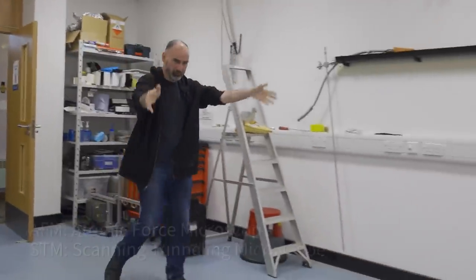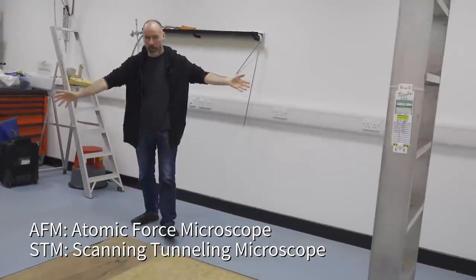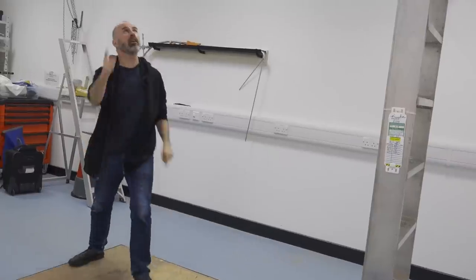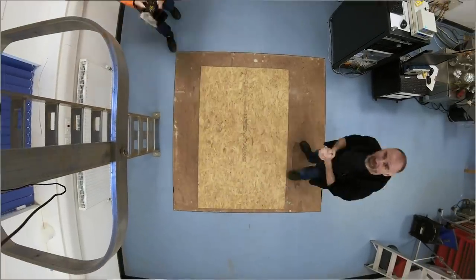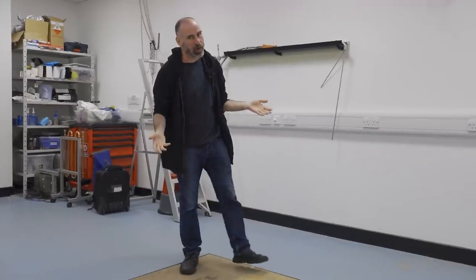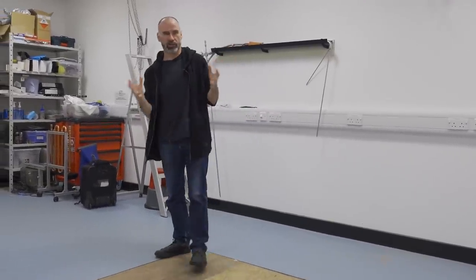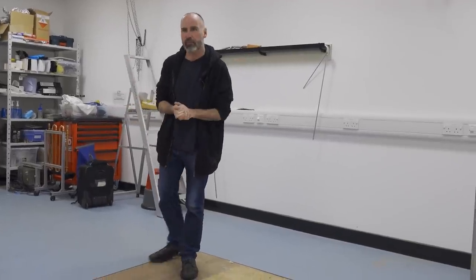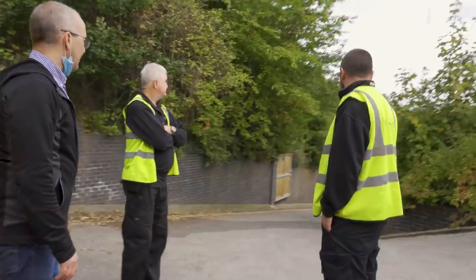So in this nicely refurbished new lab, we're going to have the new STM-AFM system in this space. As you can see, it's empty right now. Up here is a camera that's going to capture the various stages of construction of this system. It's an ultra high vacuum system, and a low temperature system as well. So there's lots of stainless steel bits to assemble, like a massive big Lego puzzle, and that's what's going to occupy us for the next few days.